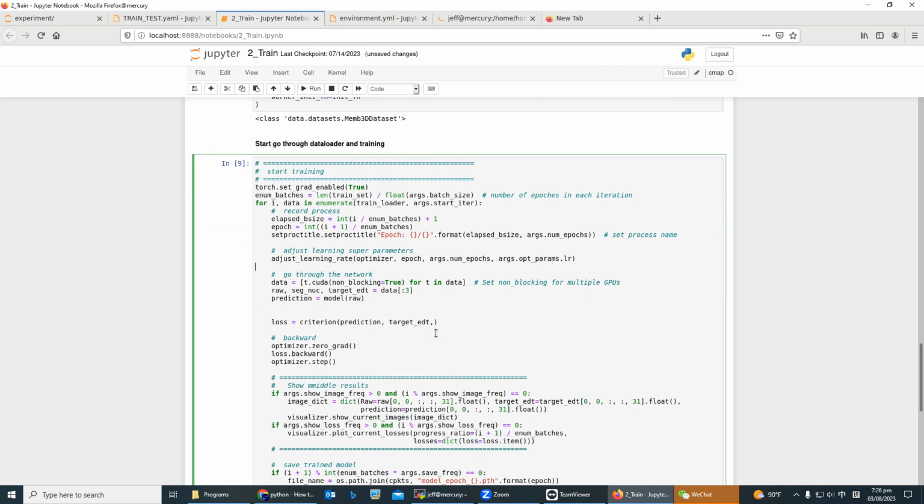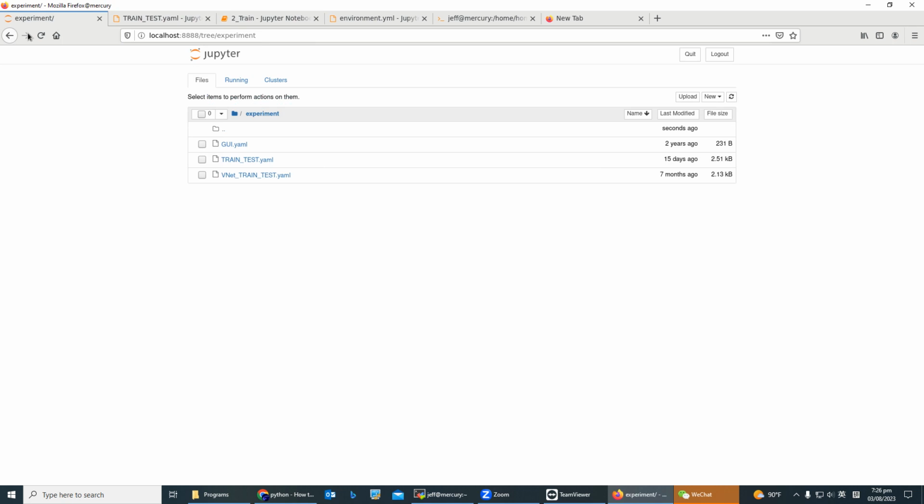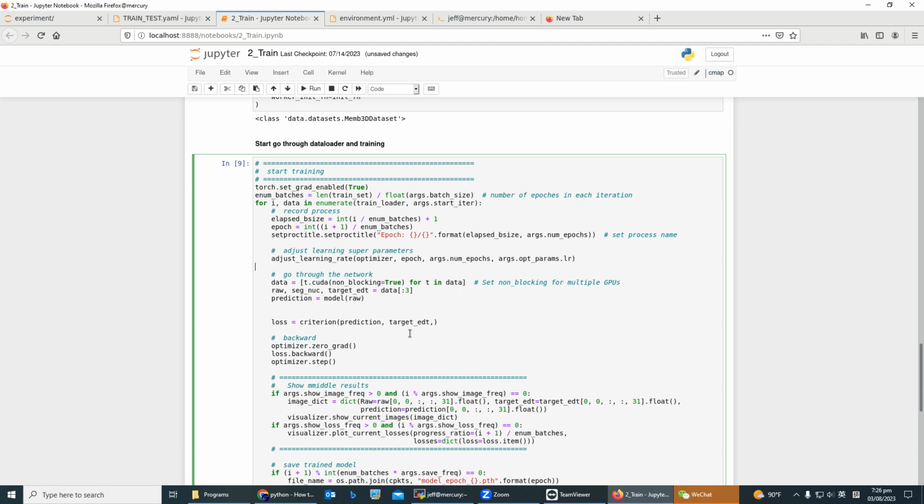Here we start to train. The training time depends on the epoch number as well as your training data length. For the example of training data, we have 54 3D volumes, and we change it for 100 epochs. It costs about 30 minutes.